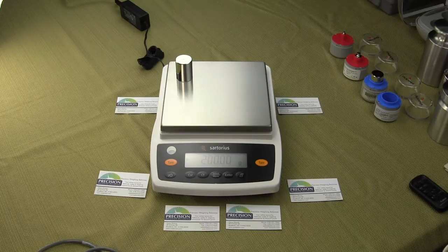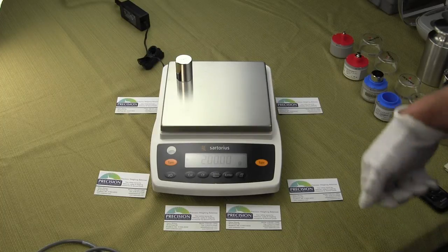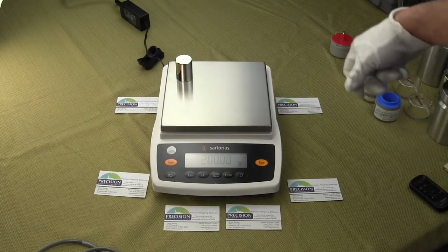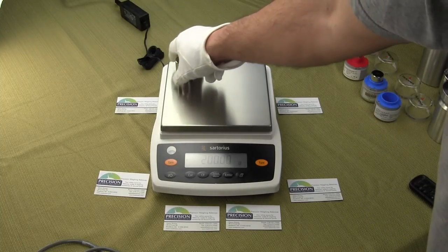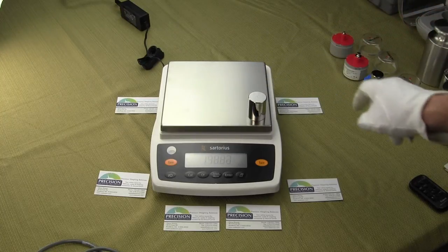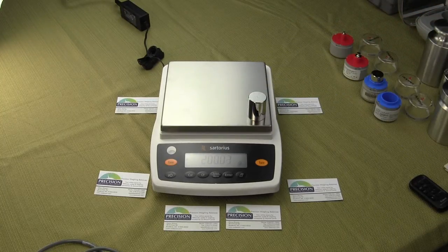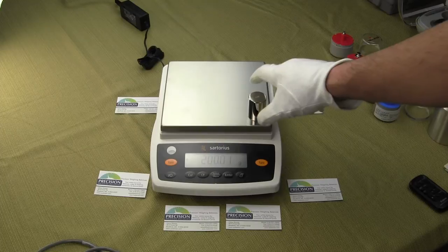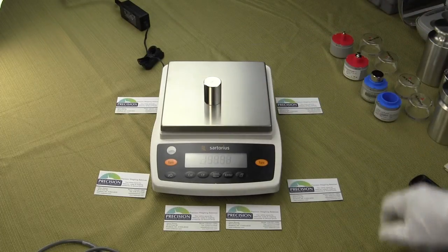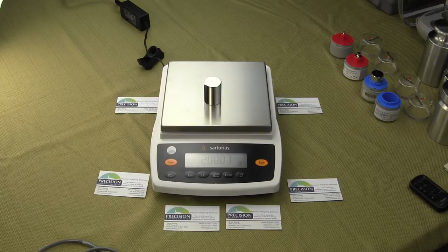The new Entrance Series is RoHS compliant, which means they restrict the level of certain hazardous substances such as lead, cadmium, mercury, and other chemicals. Basically on the printed circuit boards, most of the solder had high lead content. Now the new series has very low lead content. Sartorius did this basically because many countries require RoHS compliant.